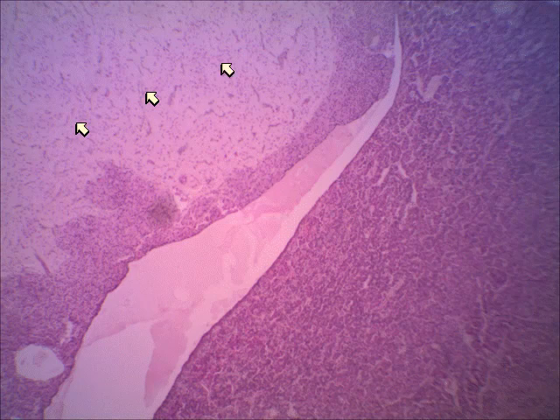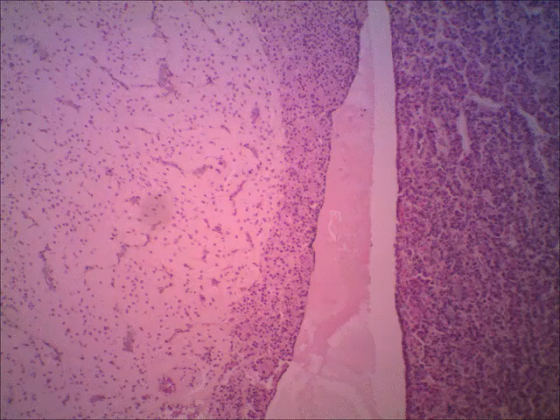Do you see how it looks a lot lighter? This doesn't have the secretory cells because, remember, the posterior lobe is simply an area where hormones like oxytocin and antidiuretic hormone are just stored and then released. They're actually hormones produced by neurosecretory cells of the hypothalamus. All right, on the next slide, we see this same slide at a higher power magnification, and again on the right, we see the anterior lobe, and on the left, we see the posterior lobe.